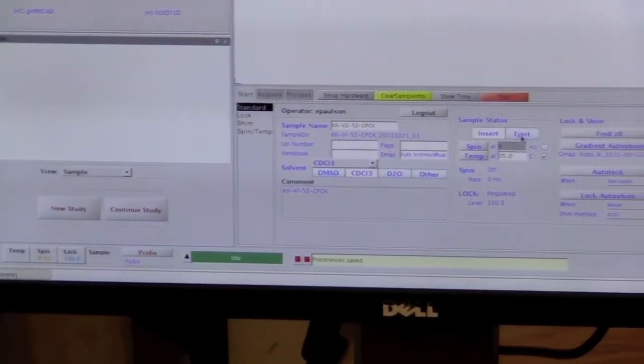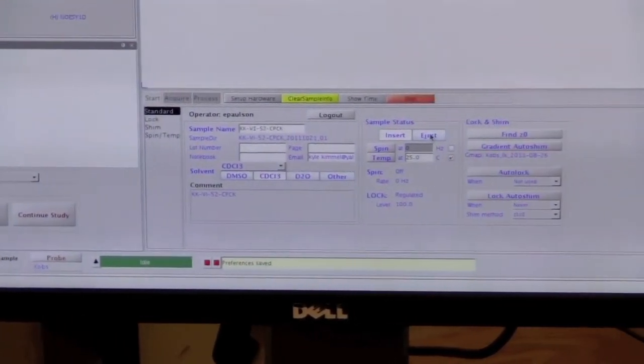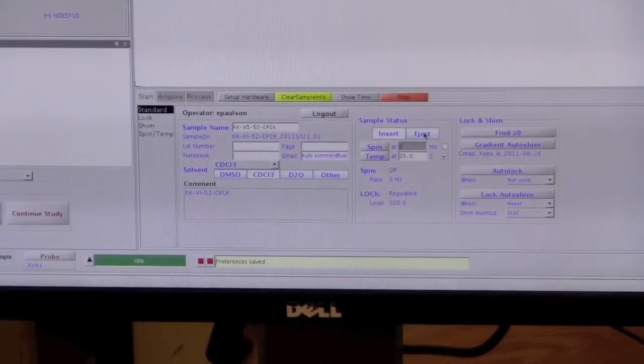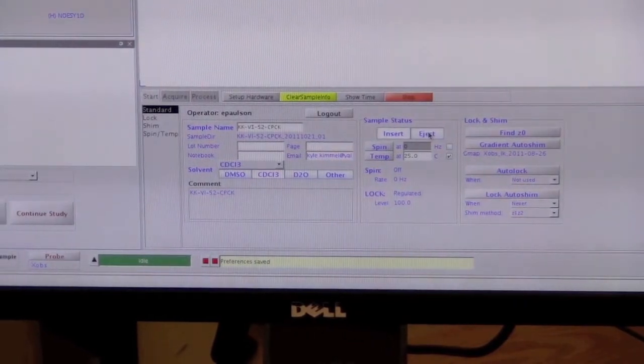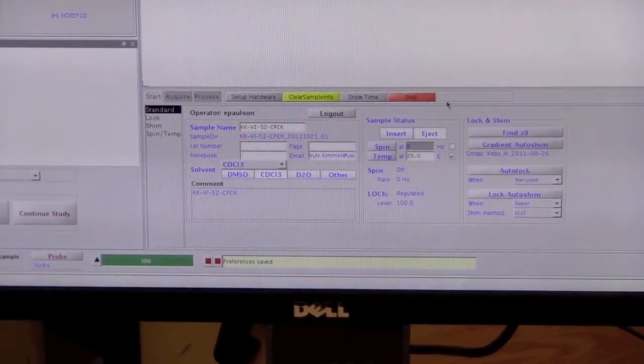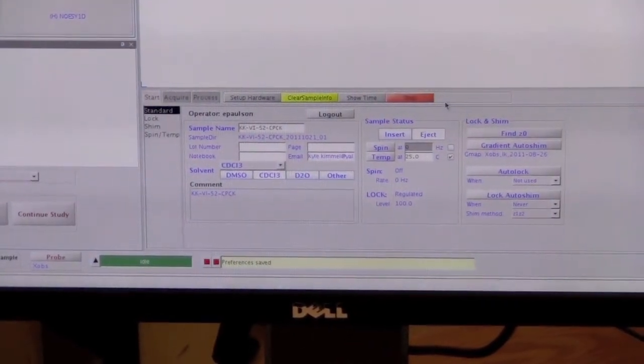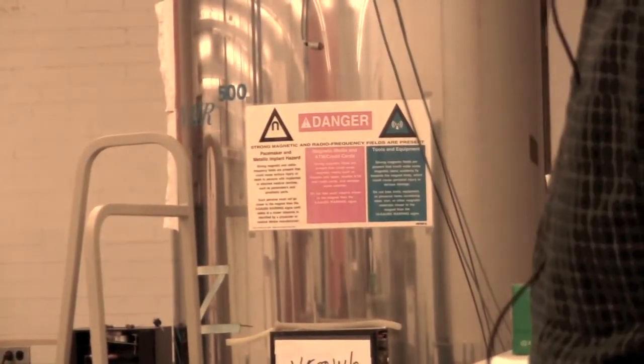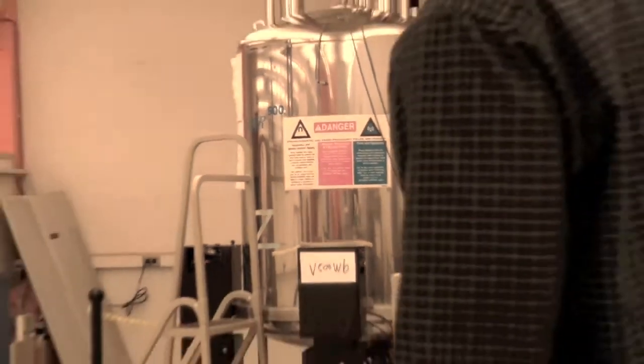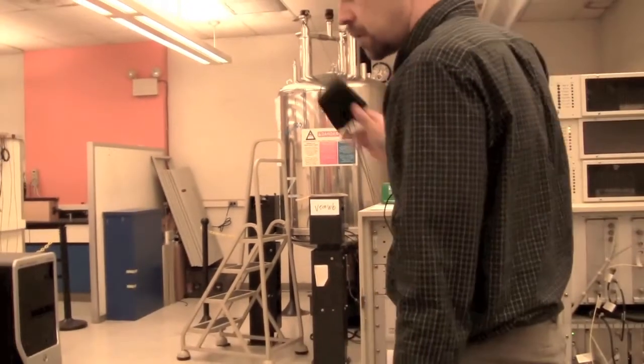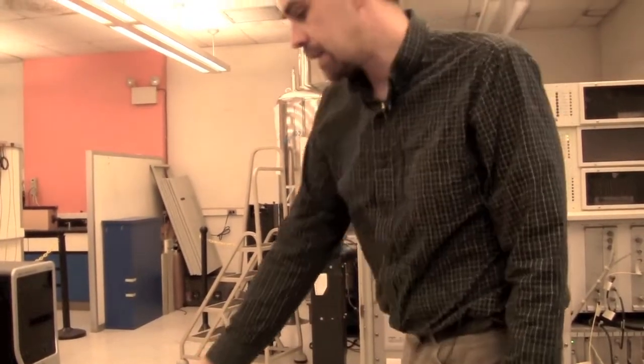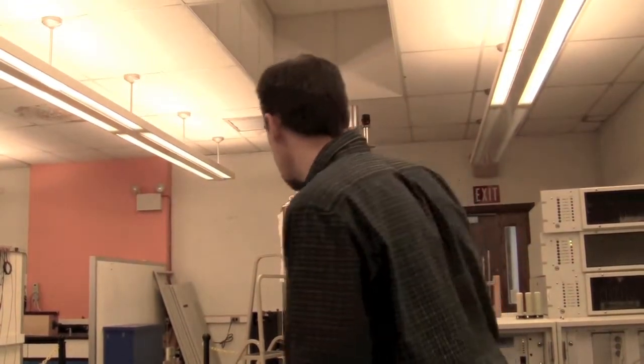So the next thing I would do is start to put your sample in. We want to click eject and it will eventually turn on the eject air. And then we want to get the dummy sample out of the magnet. Don't forget to leave your wallet at the desk so you don't erase your credit cards.